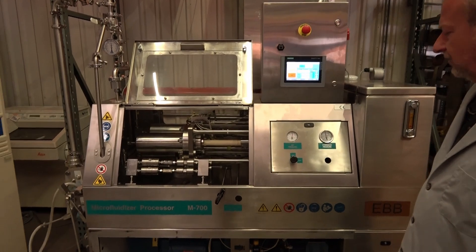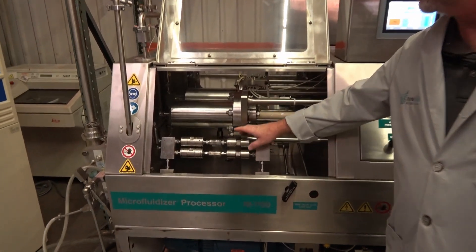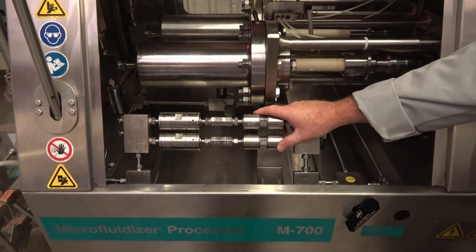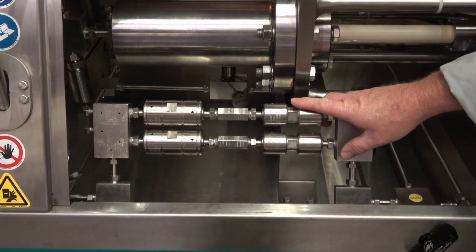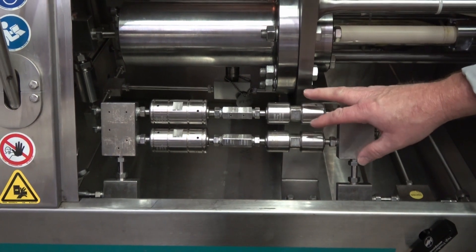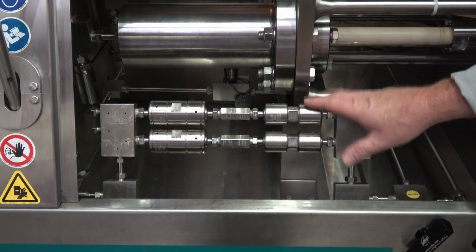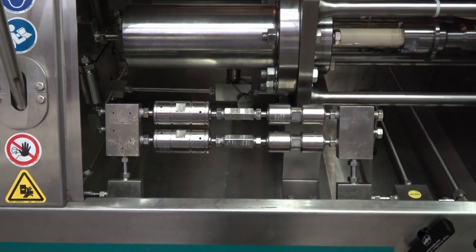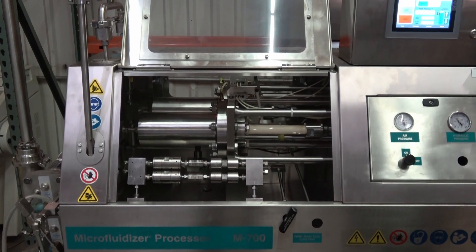Right now we actually have some smaller interaction chambers on it — these are 100 micron V chambers with auxiliaries. Ideally putting the seven-chamber units on would give you a lot more flow, but just for testing we put those on. Anyways, you can see it works well.